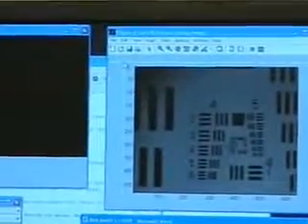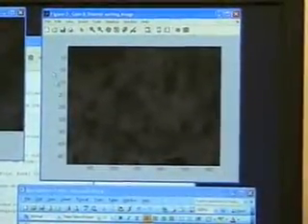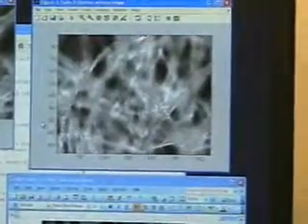And remember, when I put them up over here and did a normal left click, that set my shutter and gain to 0. I've just clicked again. See, my gain is 0. My shutter, I guess my shutter is 6, which is as low as it goes. And this is just a captured image, right? It only updates when I click. If I start moving down the y-axis and clicking, that will increase the shutter time on the camera. The longer the shutter time, the more light it can collect. So I can keep moving down. The shutter time is longer and longer.